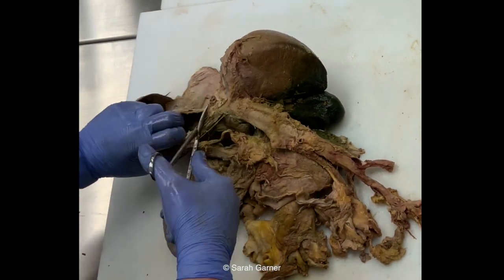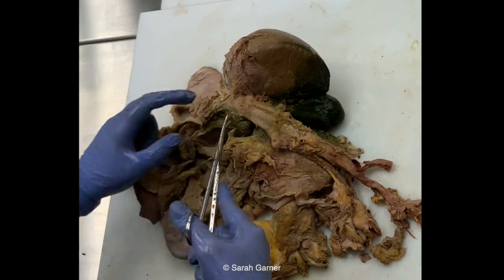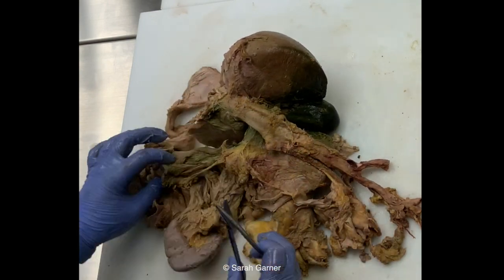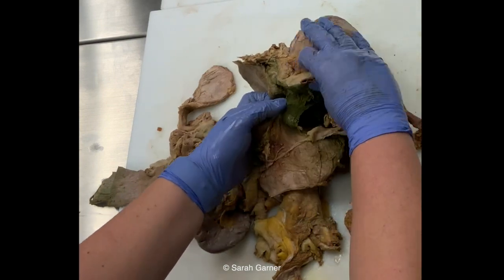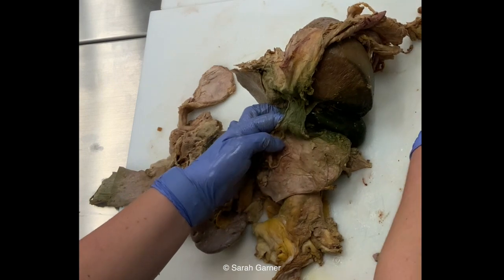So I just went around where the inferior vena cava passes through the diaphragm, and now I'm removing the very edge of that diaphragm over here. So I've just kind of gotten it out of the way. It's still attached a little bit. But basically my goal right here is to separate the liver and the IVC. That's what I'm working on.